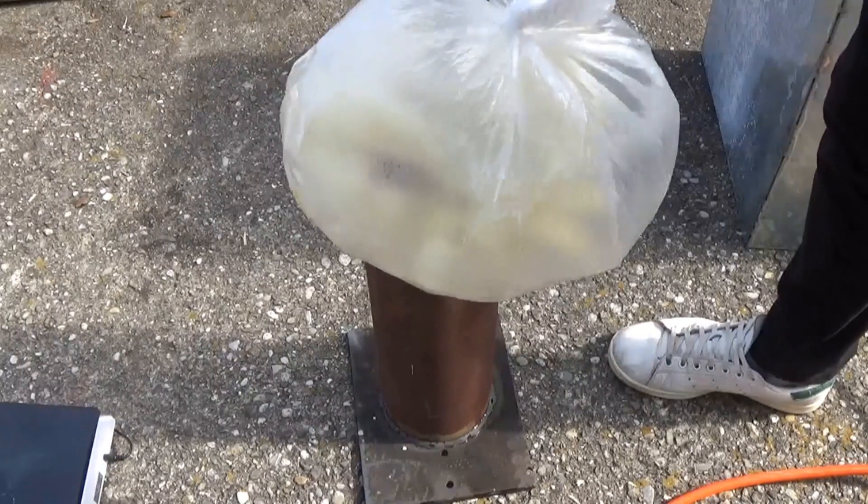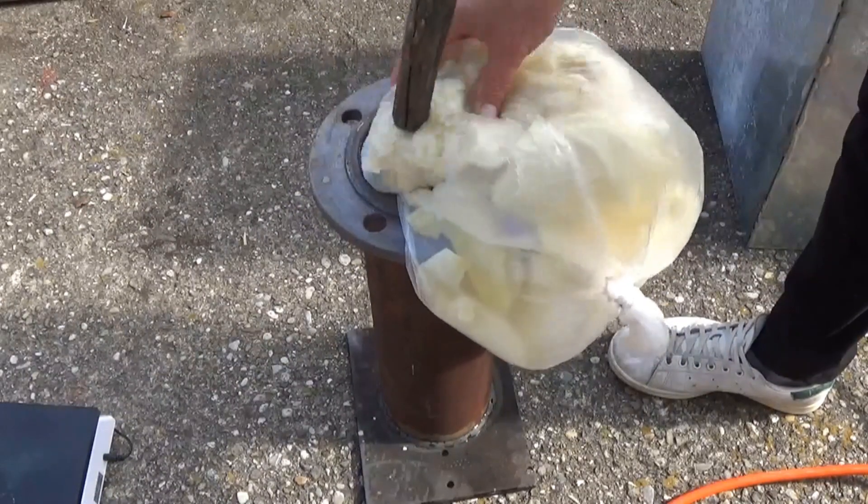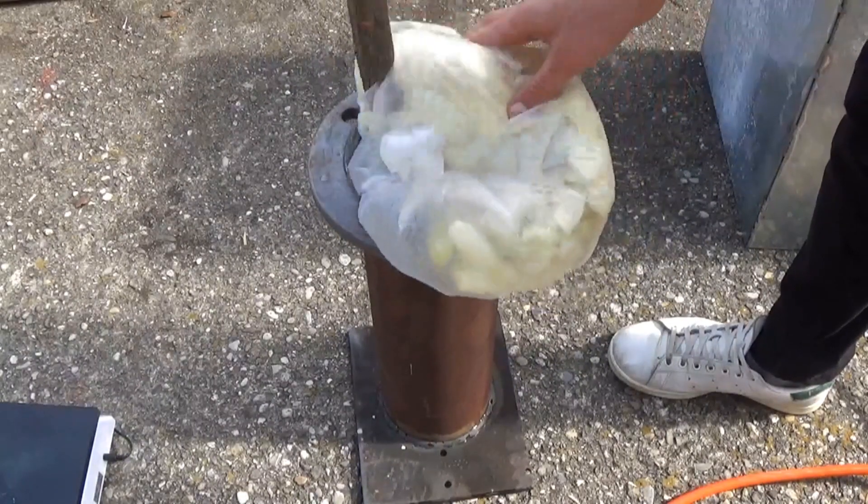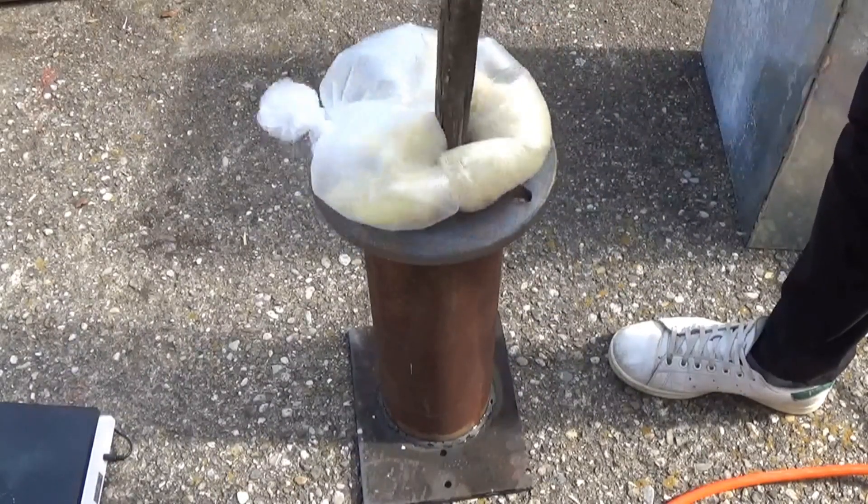The new one has a volume of 14 liters compared to the previous 47 liters. It also has a fractional column that is filled with stainless steel wool and has outlets for different fractions.